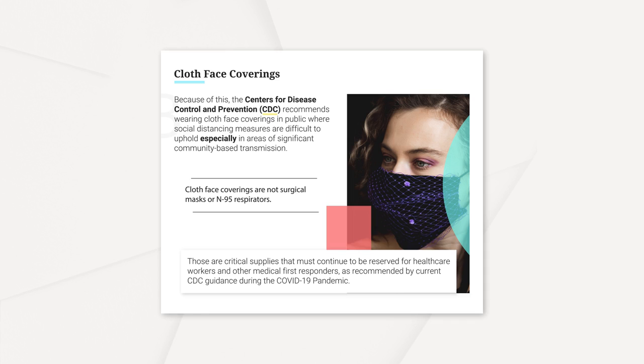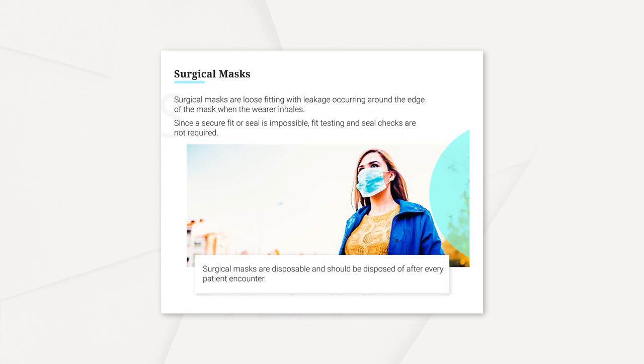Cloth face masks are not surgical masks or N95 respirators. Those are critical supplies that must continue to be reserved for healthcare workers and other medical first responders, as recommended by current CDC guidance during the COVID-19 pandemic. Surgical masks are loose-fitting, with leakage occurring around the edge of the mask when the wearer inhales. Since a secure fit or seal is impossible, fit testing and seal checks are not required.